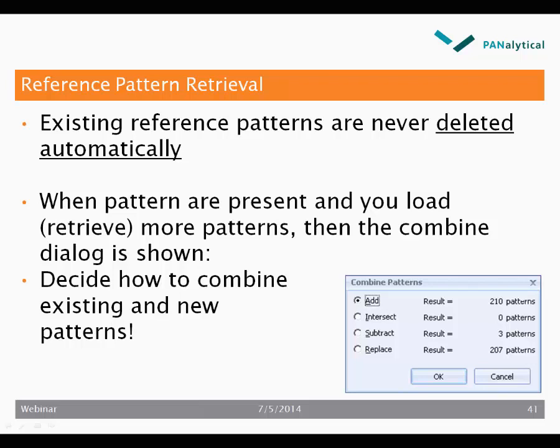Note that existing reference patterns are never deleted automatically. When patterns are present and you load or identify more patterns, then the combine dialog is shown. You have to decide how to combine existing and new patterns.